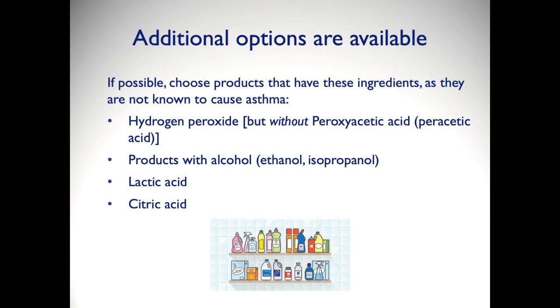If possible, choose products that have these ingredients, as they are not known to cause asthma. Hydrogen peroxide, but without peracetic acid. Products with alcohol, like ethanol or isopropanol. Lactic acid or citric acid.